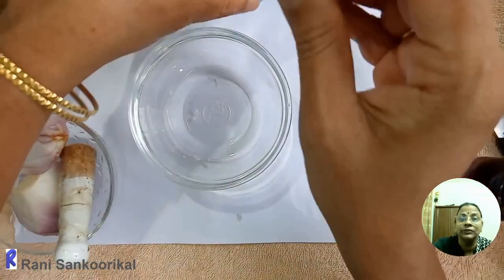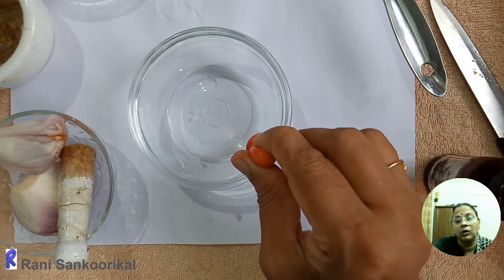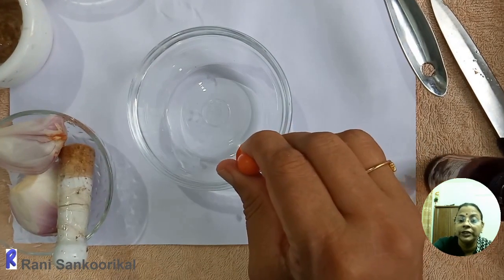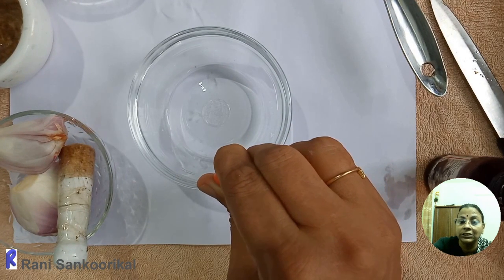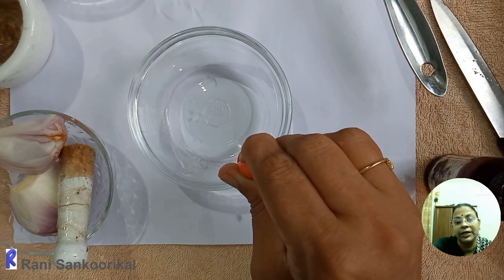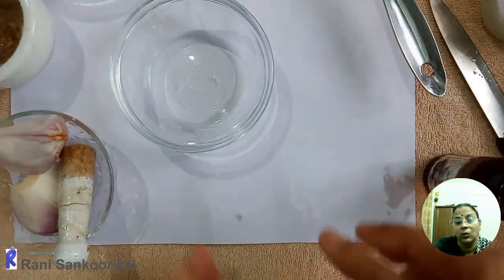Then to that you add the onion extract with the help of a dropper. When you are taking the onion extract in the dropper, pour it slowly and gently through the sides of the petri dish, bowl or even the test tube. If you pour it all of a sudden with much force, it will disrupt the junction between the solutions. So slowly through the sides, with enough patience, add the onion extract to the alcohol solution. Then allow it to rest for another 5 minutes without shaking.